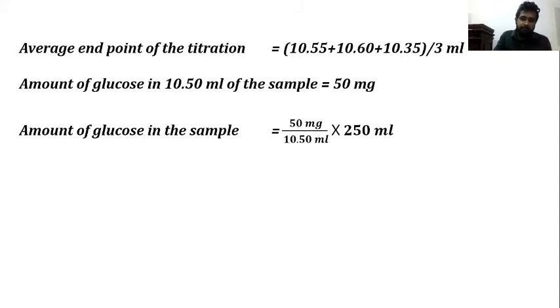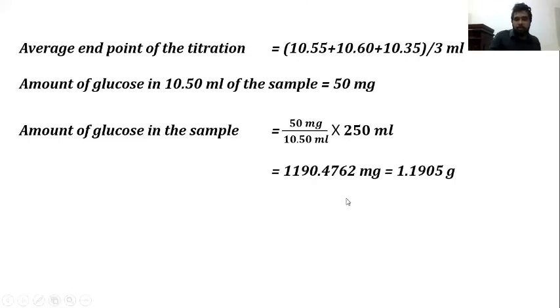It's milligrams. 1190.47. Okay, good. Then it's in milligrams. Yes. If we convert that into grams, it's about 1.1905 grams.